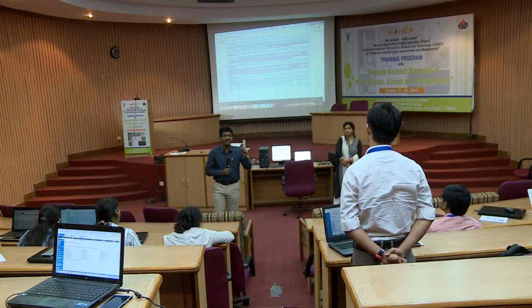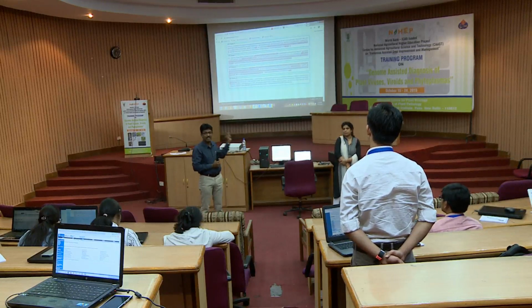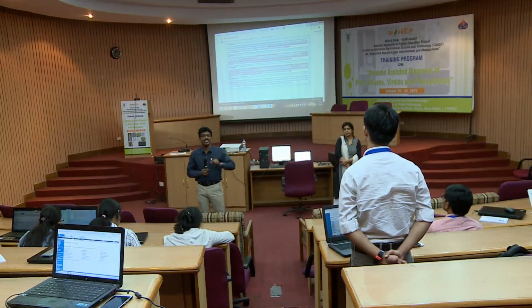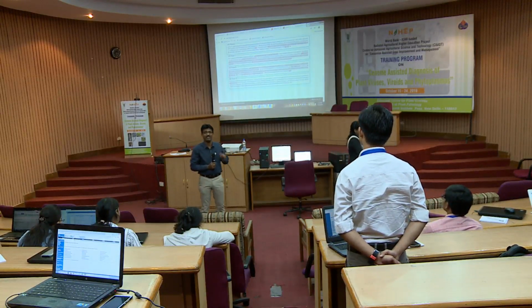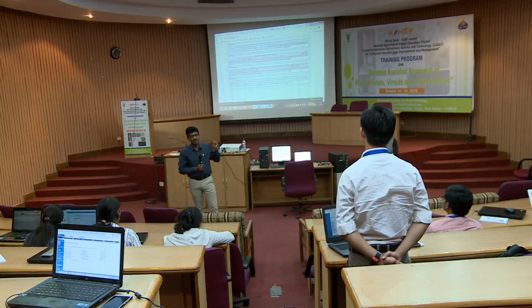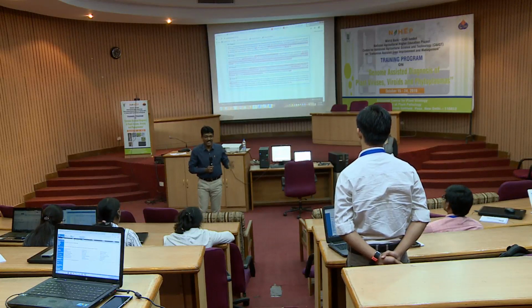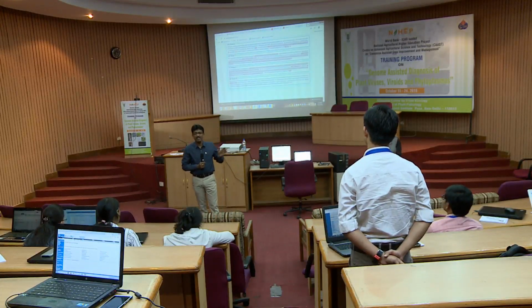This can be deciphered only with the help of the chromatographic file that Dr. Neelam highlighted, right? So the purpose of this training is that only. You should be able to read the chromatographic file, not the sec file. The reviewer would insist on trace files or chromatographic files, not the sec file. You extract the sequence from the best base calls, right? So again, she made it very clear. I was listening.